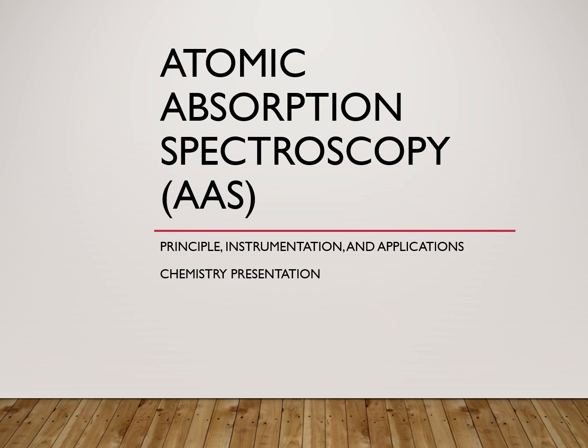In this lecture, we will discuss its principle, instrumentation, working, types, interferences, and applications in detail.